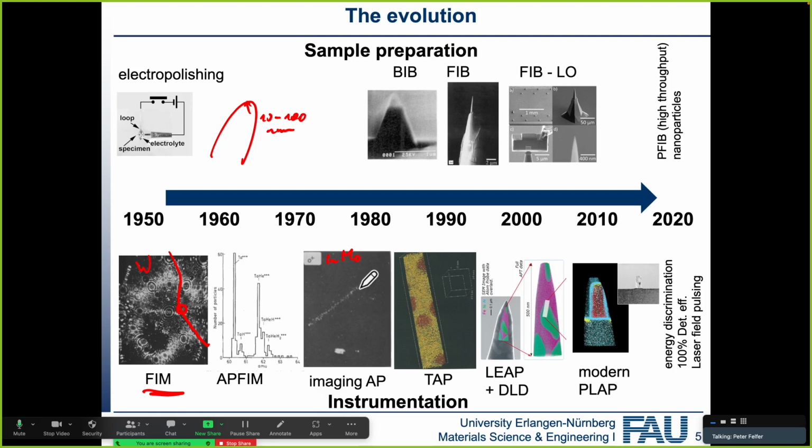But in this case, you can see where certain ions are, but you have to know beforehand what you're looking for. And then you can only see that one type. So if I wanted to see at the same time where other stuff is, then I cannot see it for the same section, because the detector is only on for a very short amount of time.